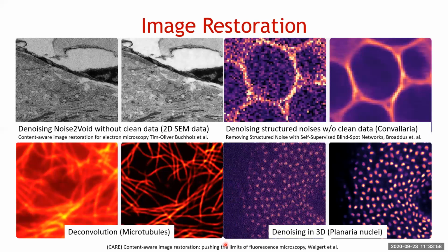So it's much gentler on your sample and it's much quicker. And then you would feed it through some deep learning networks and you get something back in return. Now that seems a little bit dangerous, of course, because it was still trying to get organized in deep learning, and you want to make sure that it's going to work at the end. But this is probably the future, to be able to take less than ideal data, but know that you will have usable data at the end once you pass it through a network.